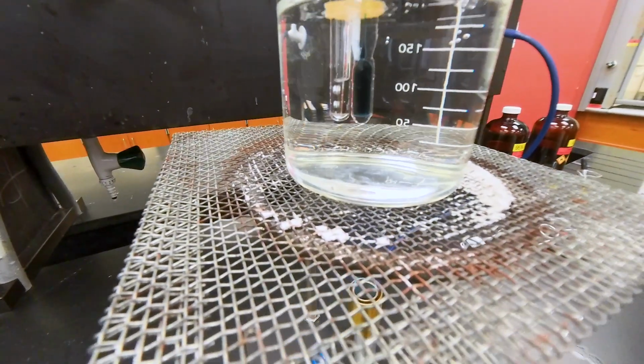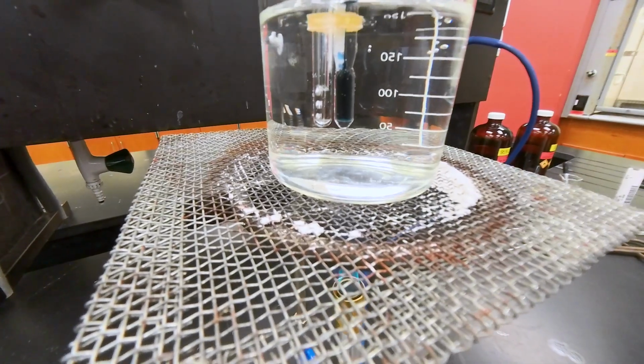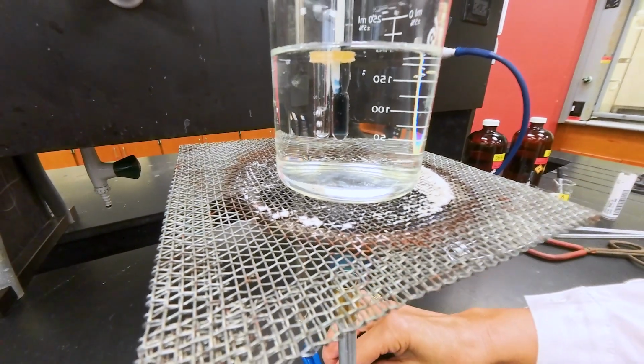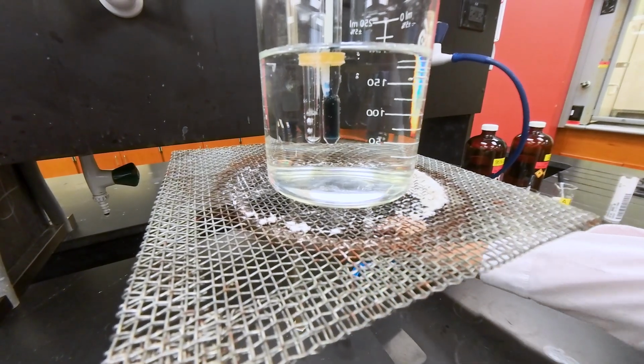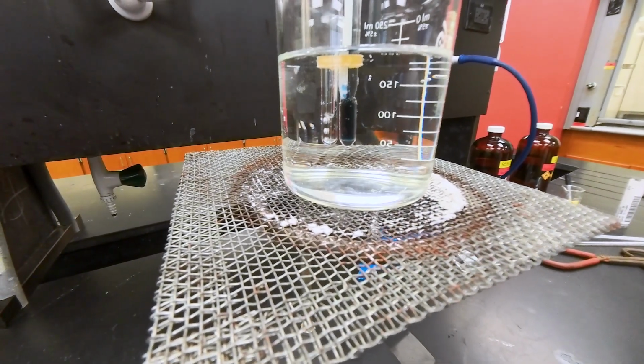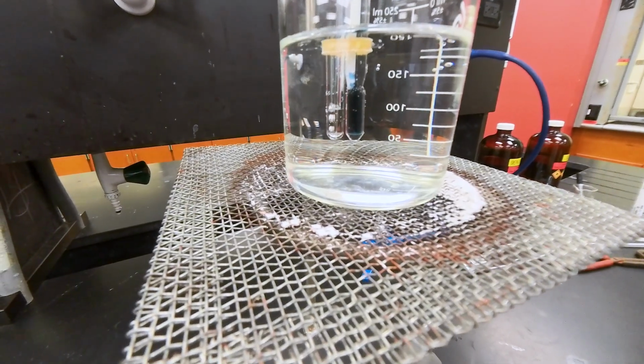Okay, you see the bubbles are coming very fast now. Those bubbles, a stream of bubbles coming out very fast. Now is the time for me to remove the Bunsen burner and let it cool down, and we are waiting for those bubbles to stop coming out.